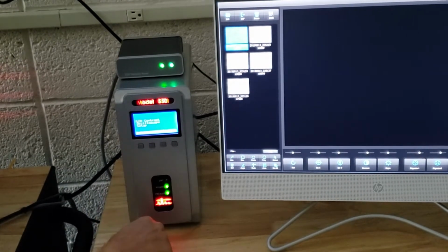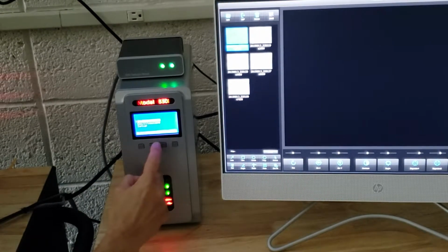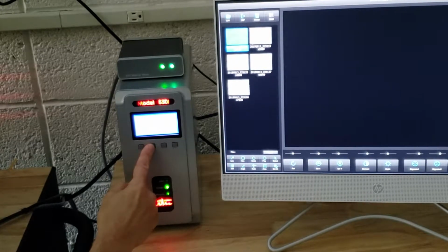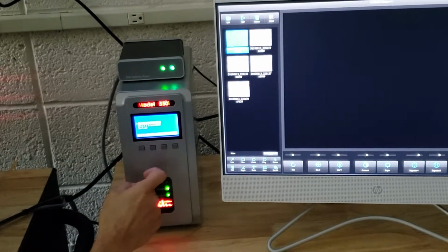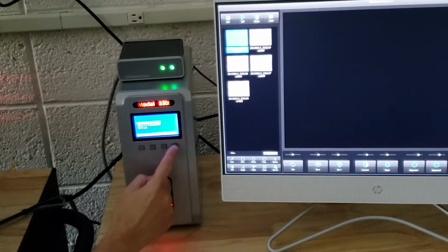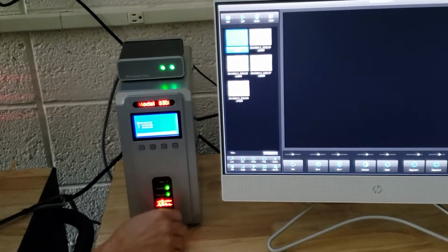So right now, if I'm on LCD contrast, and if I go enter, it highlights that feature. If I turn up the brightness, it gets so bright that I can't see anything, right? So all that is just the contrast of the display. Basically I'm just going over this so we sort of know what things do. As soon as I hit enter, it's finished with that. If I go to oscilloscope and hit enter, it gives me the detector.